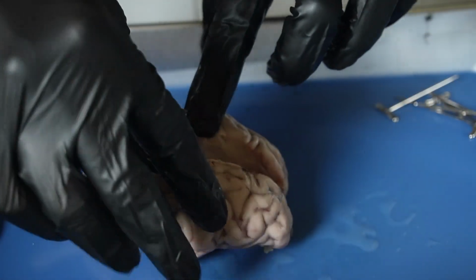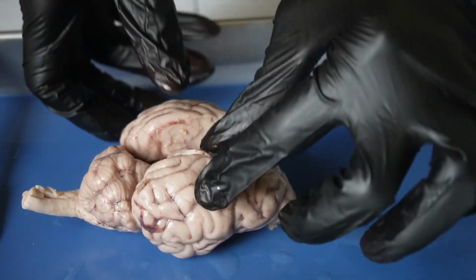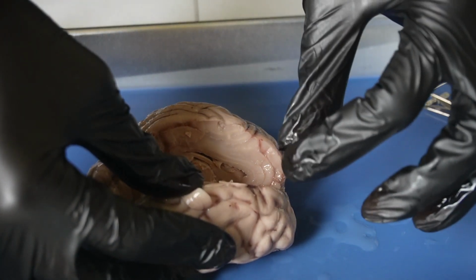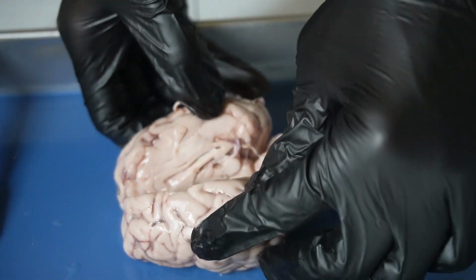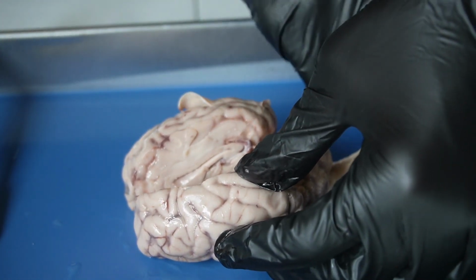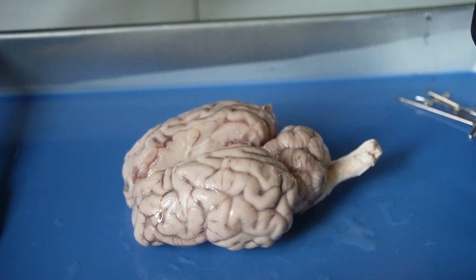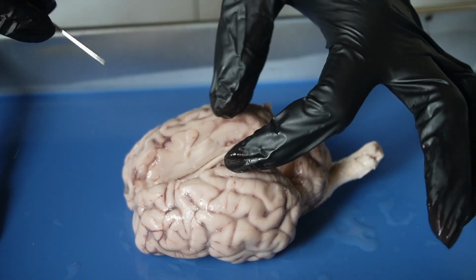All right, so now that I have made this sagittal cut, where is it? Okay. So the next brain structure, there we go, structure, I couldn't think of the name.